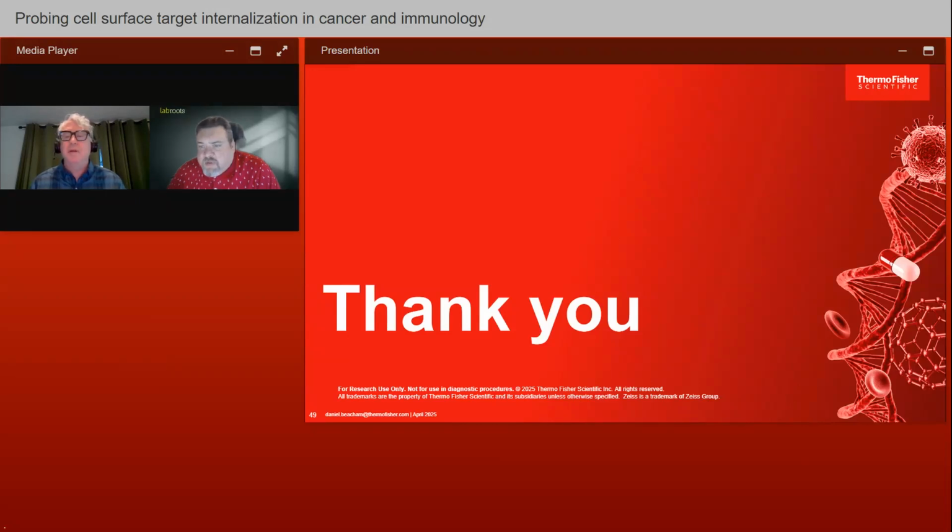Do you know if the CellLight works with endothelial cells? Oh yeah, the CellLights. Yes, they do. Again, it's from cell type to cell type. You'll see differences in tropism. I have a whole separate bunch of material on the CellLights as one of the developers, and our recommendation is always to titrate the particles per cell count with every new cell type you try in the reagent class.